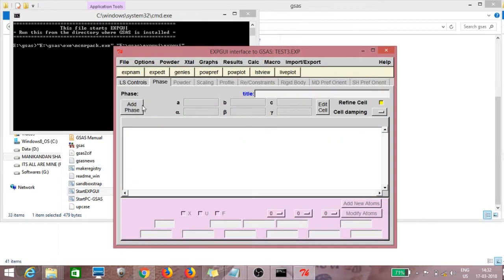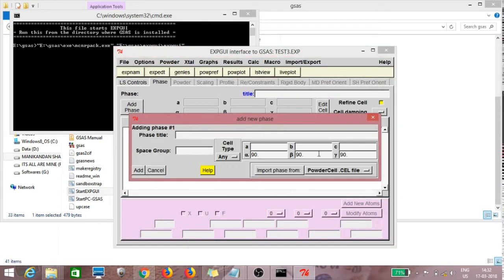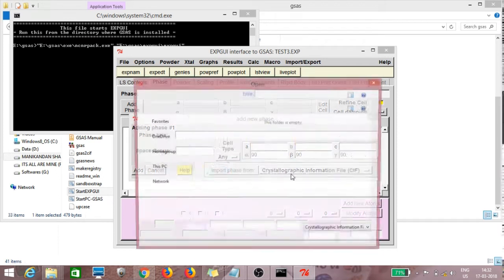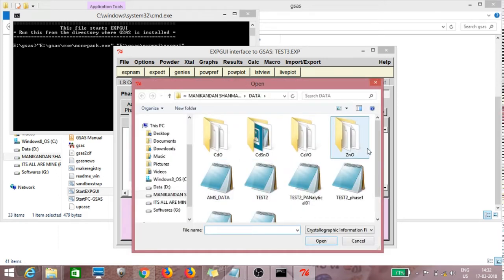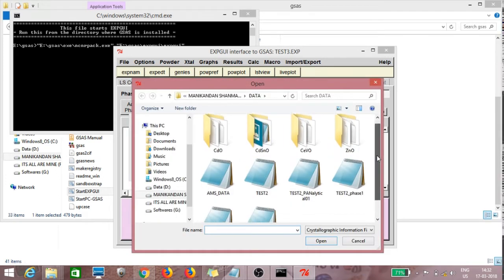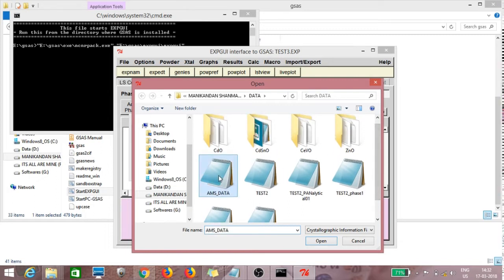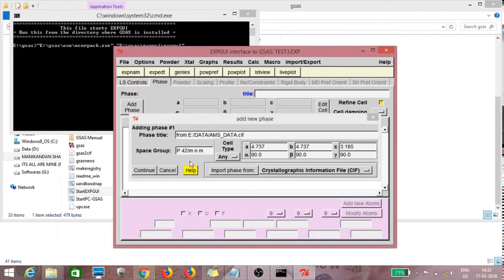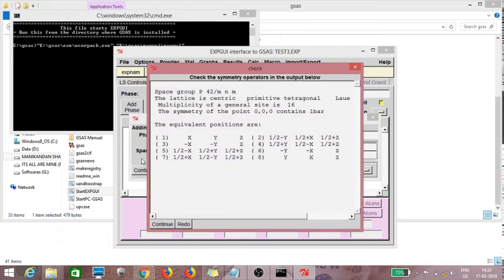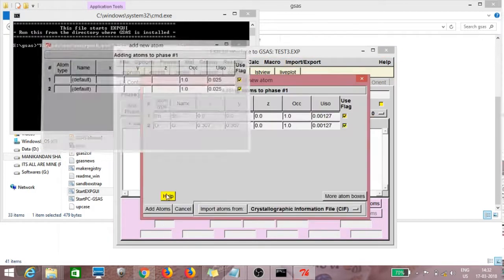This is a problem. Your sister is a problem — in the inner leader it will clear, the color it will clear. The idea is a problem. MS data. Continue.